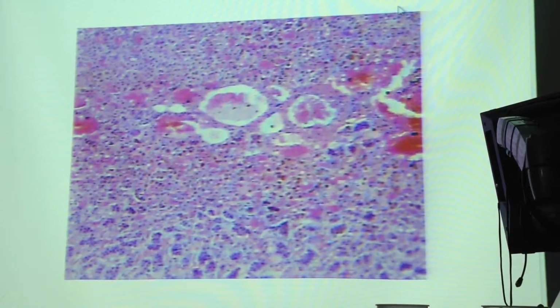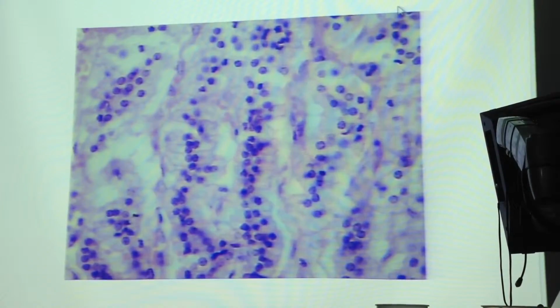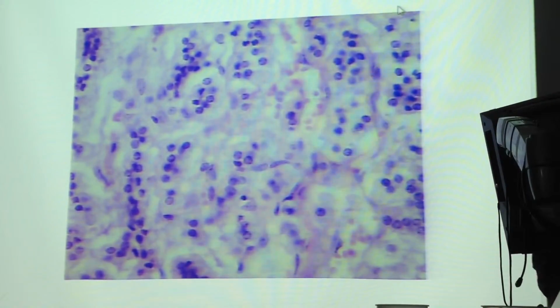Okay, let's look at the cortex. Now, there are three regions of the cortex I'd like you to identify, and each region is associated with different hormones. The outermost region, most superficial, adjacent to the capsule, is this region here. In this case, the cells are kind of oval or round clusters. If you've got a good imagination, they almost look like the glomerulus in the renal corpuscle. I'd say good imagination. That's probably where it gets its name. See these things right here. This is called the zona glomerulosa.